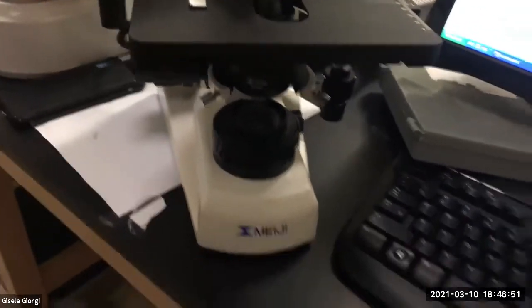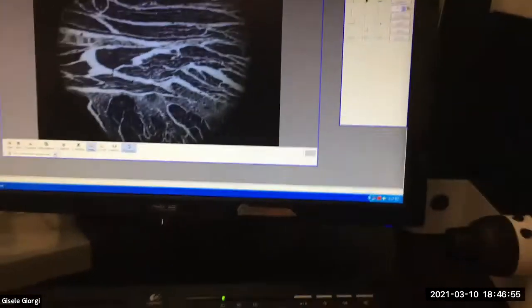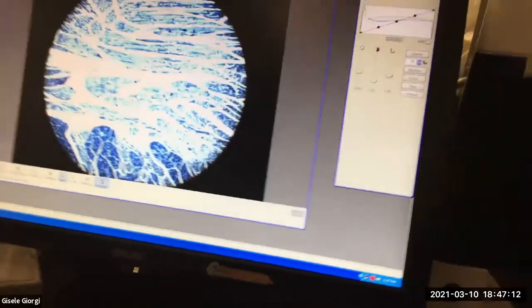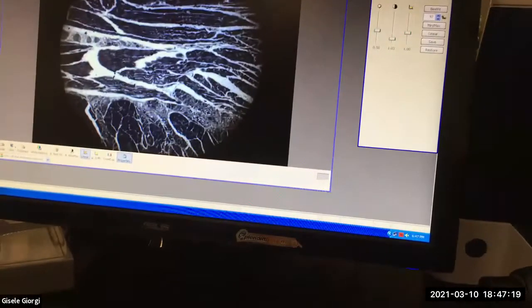Let me show you that over here on this scope, actually. So I showed you, this scope has a 2.5X, I don't know why. It's an atypical lowest mag instead of a 4X, but I'm going to go to the 10X. So we did a pretty good job on the 4X, nor the light. It's doing auto exposure and it's doing really badly. As software does.